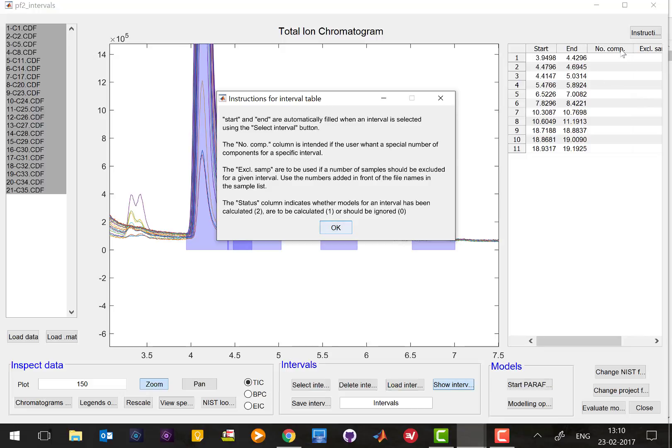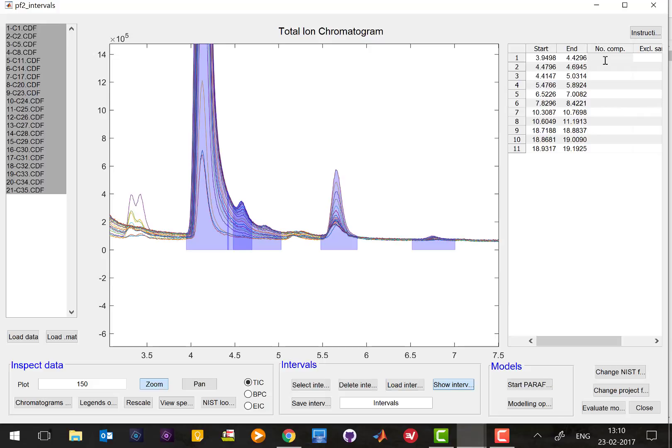Let me just explain you what is number of components. If for example in interval one you don't want components to be one to eight you can actually set here yourself, you can actually do let's say one to four and for the second one I don't want one to eight but I want one to five only.